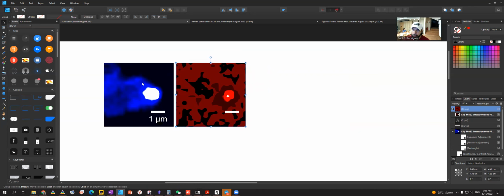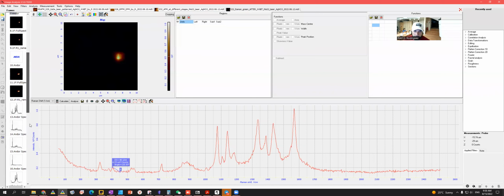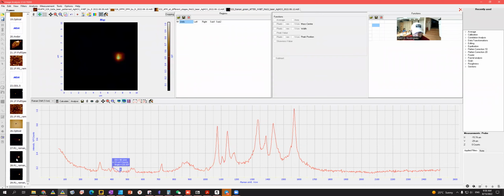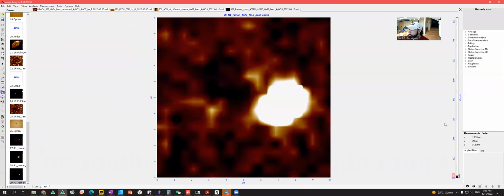If you see, this one looks smooth, this one doesn't, and that's because of the noise level. If you're not satisfied with this, if you think maybe we can make it nicer, you come here. That's the molecule, right? Yes, that's a molecule. What you can do is play with this background, something like that.